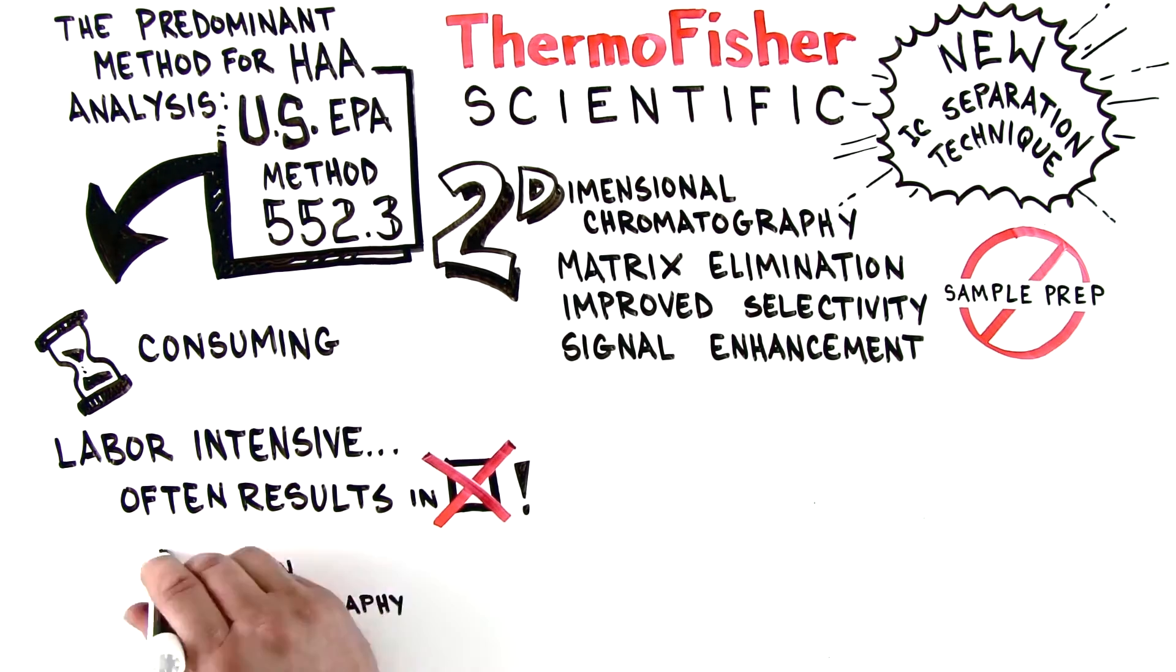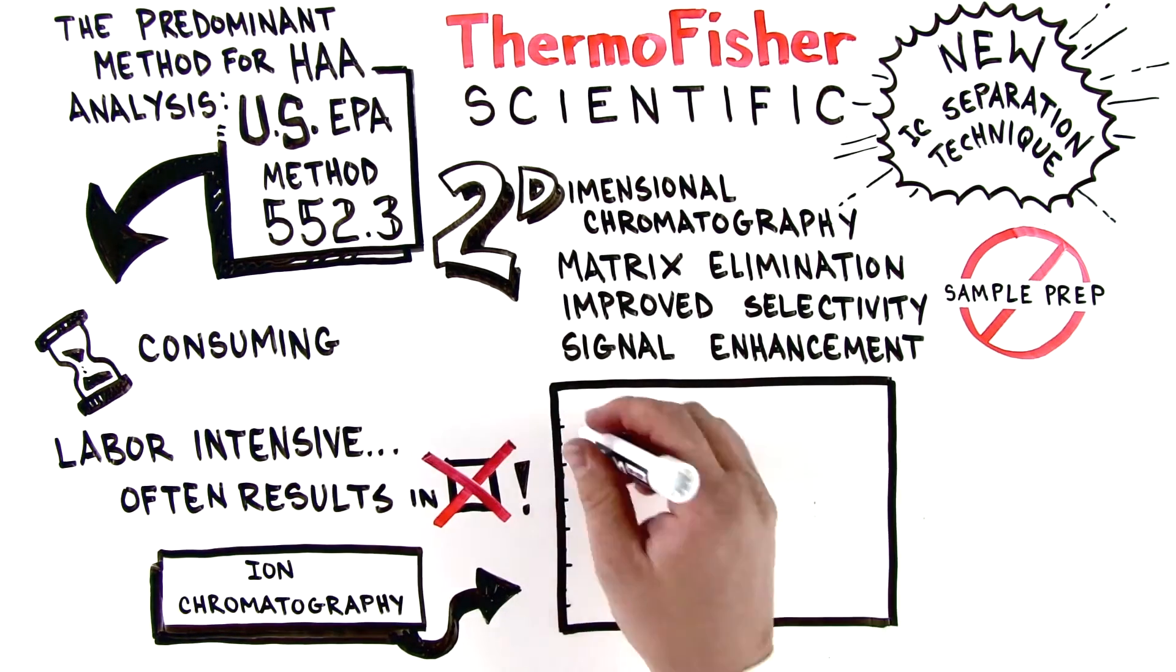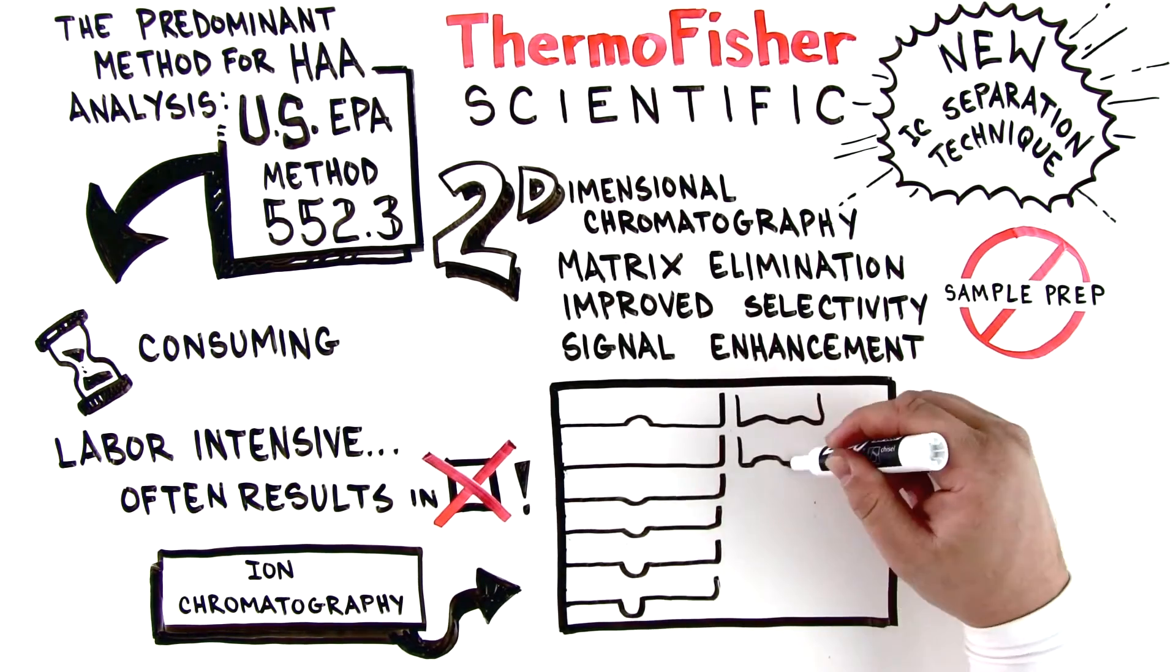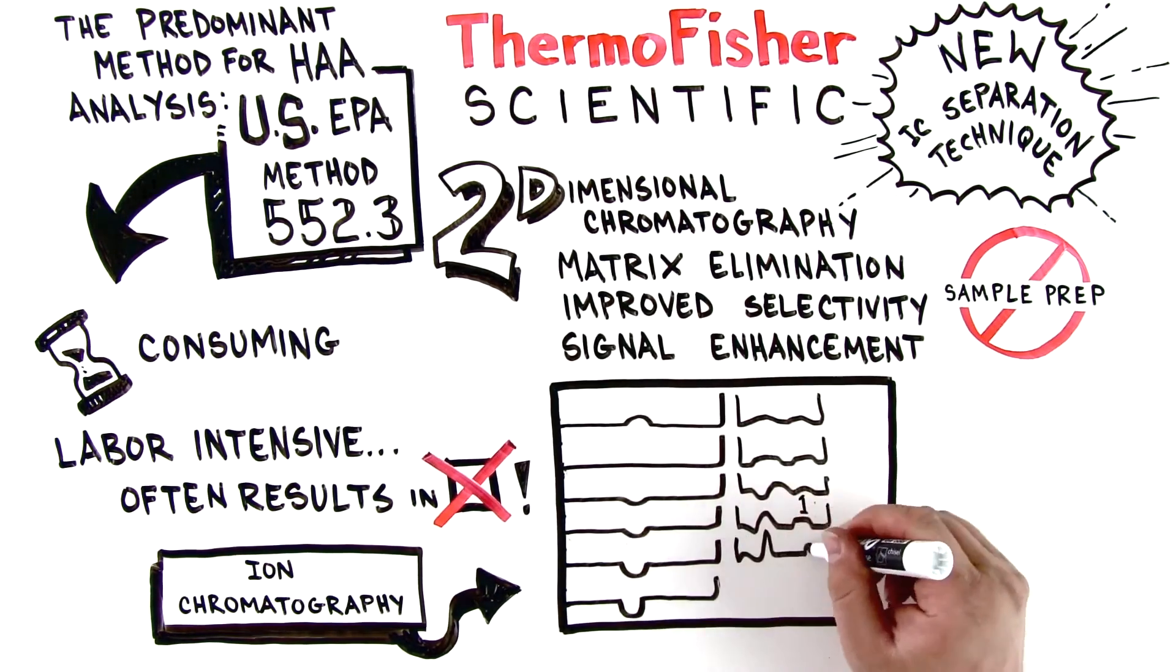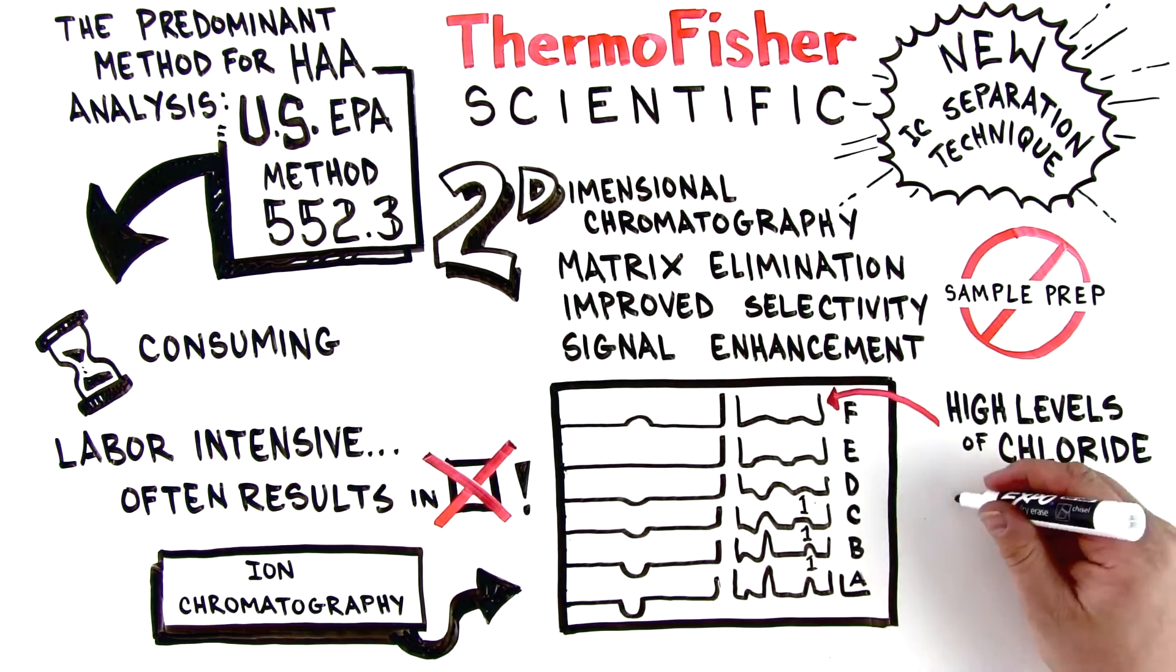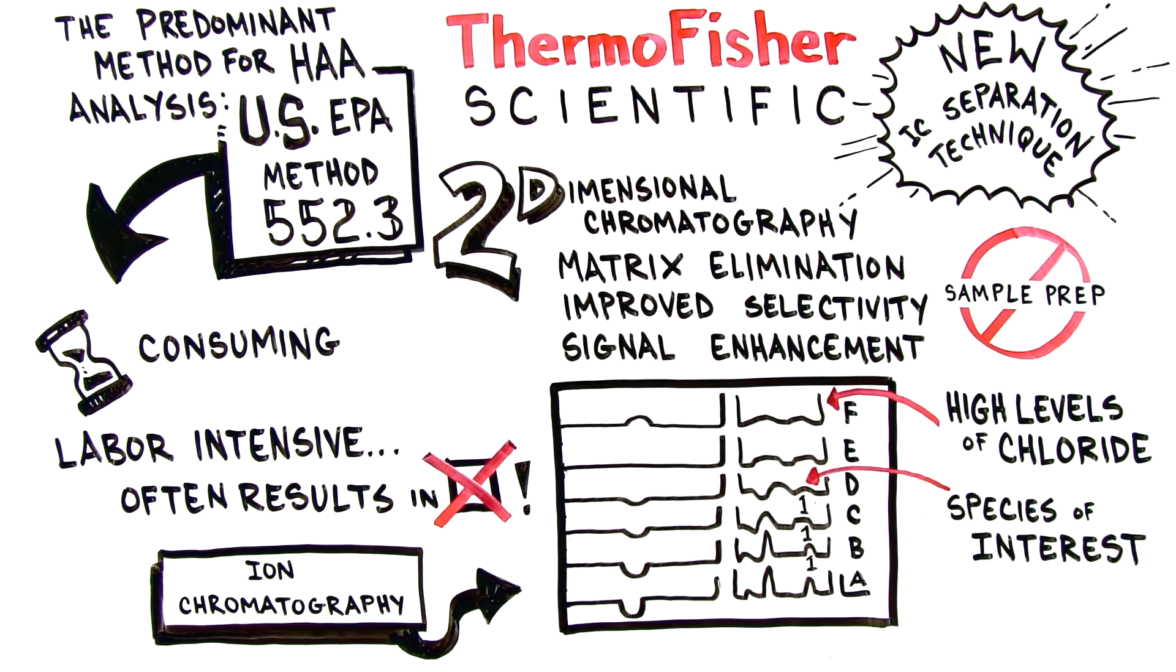When using ion chromatography, water samples with high levels of matrix ions in drinking and wastewater can interfere with trace contaminants analysis. This is because the matrix, such as high levels of chloride, elutes close to the peaks of interest, thus smearing the peak and increasing the band broadening, which causes recovery problems.